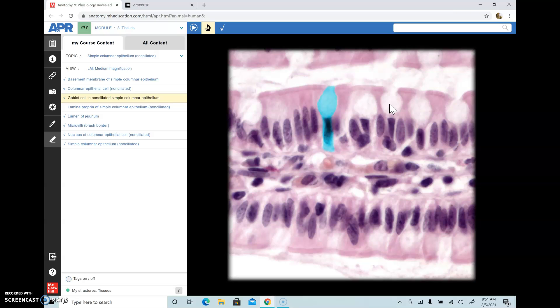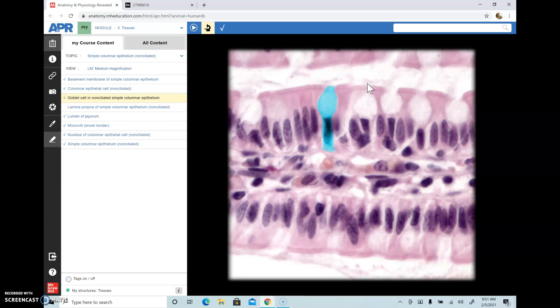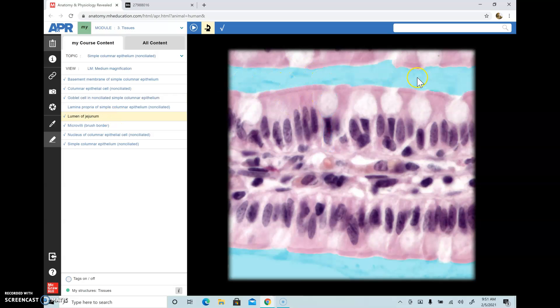You also find a lot of goblet cells in the female reproductive tract. Goblet cells produce mucus towards the lumen of the structure because they function in protecting the underlying organs. They also help in trapping dust and debris in the upper respiratory tract. In regions like the intestine, they form a good layer of protection because food is constantly churned — the mucus acts as a lubricant and protects the underlying organ from abrasion. This here is the lumen of the jejunum, which is a part of the small intestine.